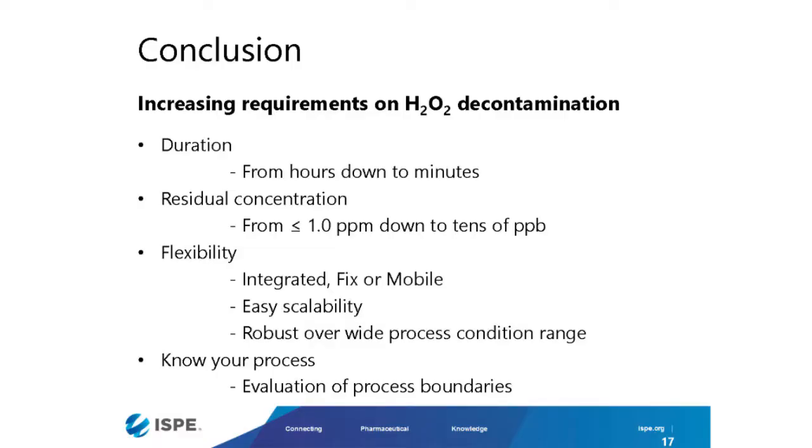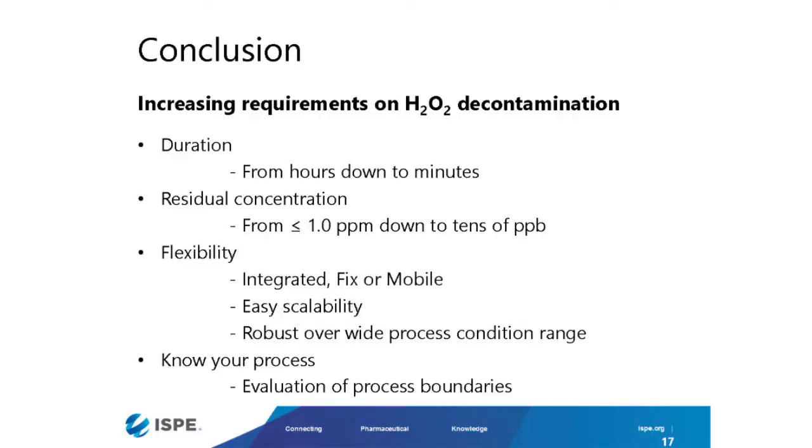Important for them is scalability. Often we don't know how the product will be accepted. Maybe they want to extend the production soon. So scalability of the isolator systems with integrated H2O2 decontamination is a big topic right now. And especially with room decontamination, the decontamination must be robust over a large conditioned space in the room.